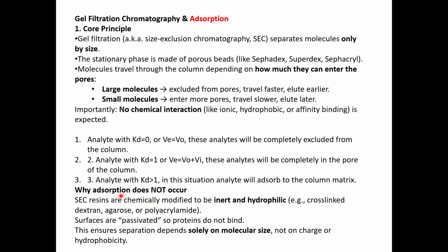Why it should not occur is that your SEC resins, that is your size exclusion chromatography resins, are chemically modified to be inert and hydrophilic. The materials that are used are made in such a way that they do not interact with your proteins or other biomolecules. So they are usually cross-linked dextran, agarose, and polyacrylamide, which will not interact with it.